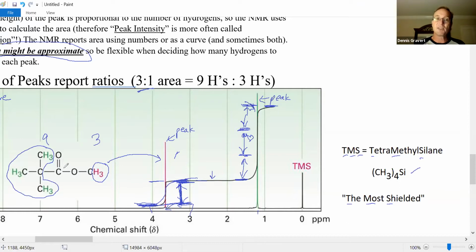So the farther downfield, that means the electrons that were shielding the hydrogens have been pulled away by the electronegative atoms, right? These hydrogens are close to this oxygen. They're 2 bonds away: the hydrogen has 1 bond to carbon, and the second bond gets to the oxygen. Whereas these hydrogens are 1 bond, 2 bonds, 3 bonds, 4 bonds away from the pi bond. They're not affected as much by those electronegative atoms and the pi bond. They're not de-shielded as far. The closer to electronegative atoms, the more de-shielded, the farther downfield they are.